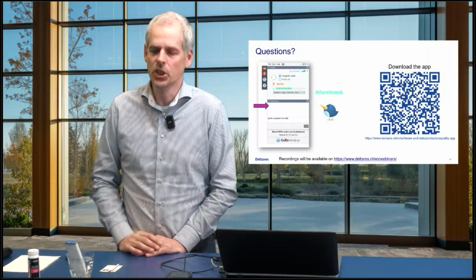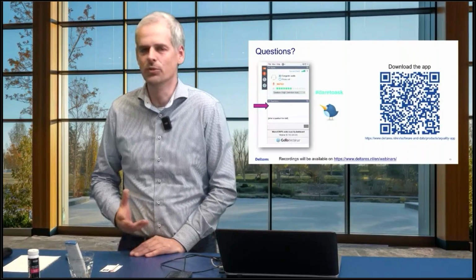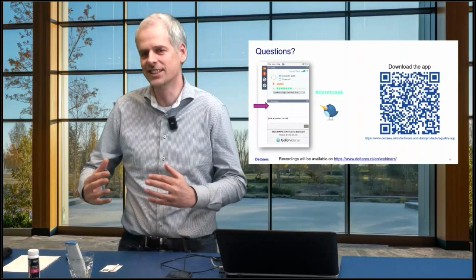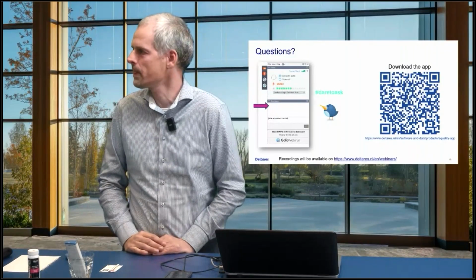And be aware also that phosphorus, with this device you only measure dissolved phosphorus, so it's not all the phosphorus that is particulate, so that's attached to particles in the water. Yeah, that's good to remember indeed, right?